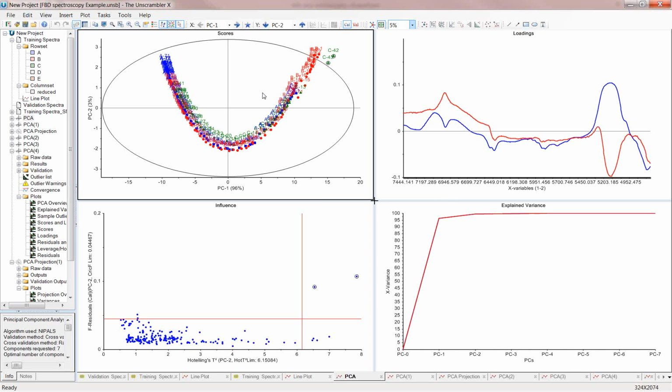What would be the typical wavelength range to expect water overtones in inorganic matter? Same thing. Water is going to show the same regardless of what type of matter you're looking at. So you're looking at that 6800 range and that 4800 range.